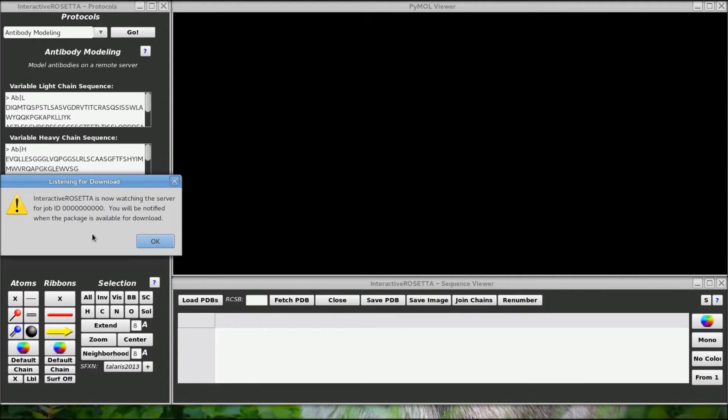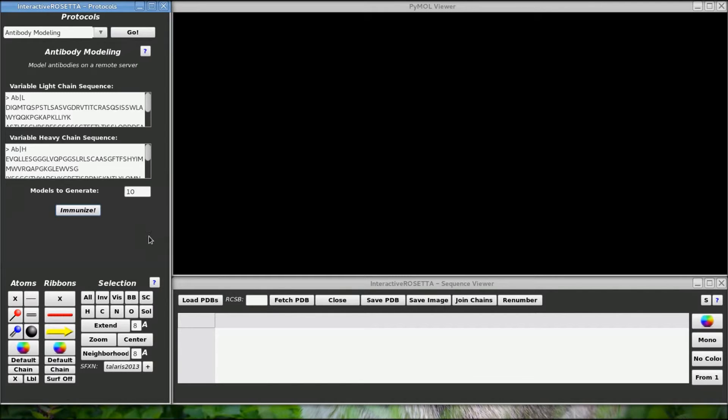This protocol will only run on an external server since I could not figure out how to use antibody modeling in PyRosetta, if you can even do it at all.